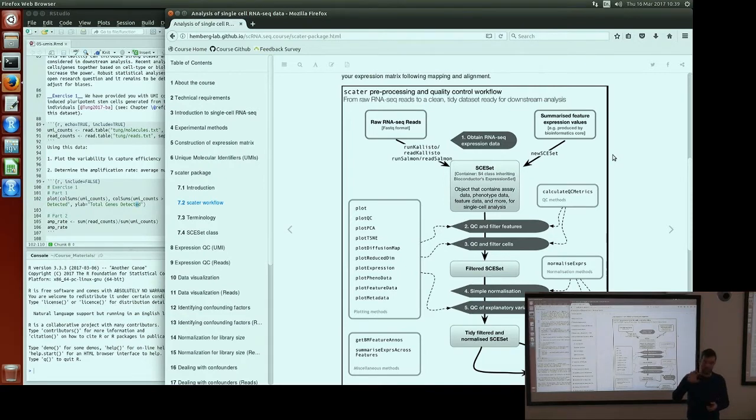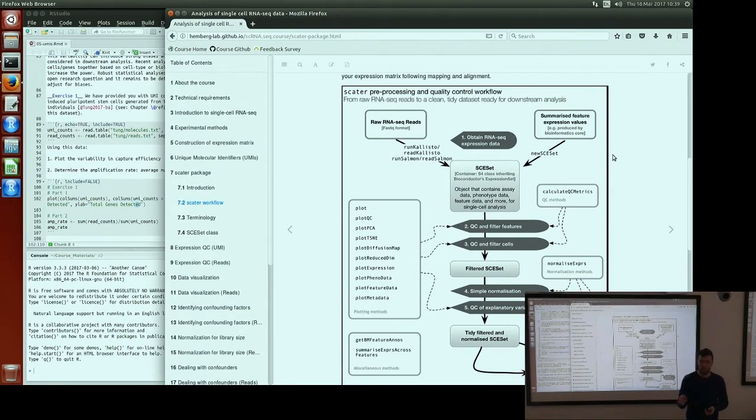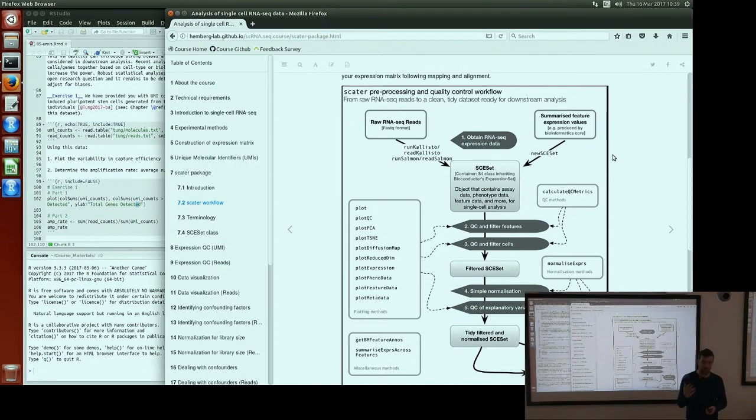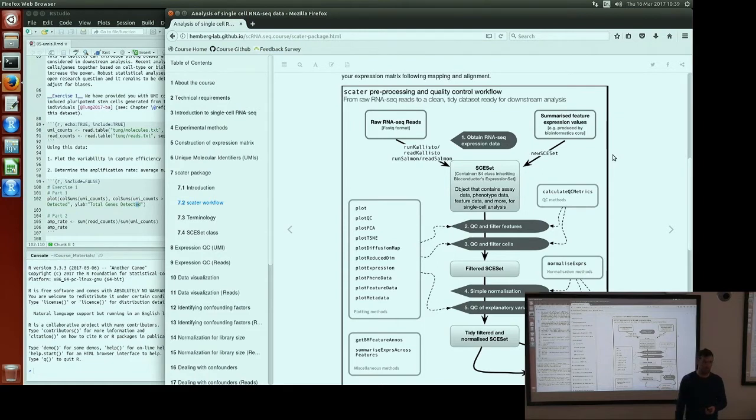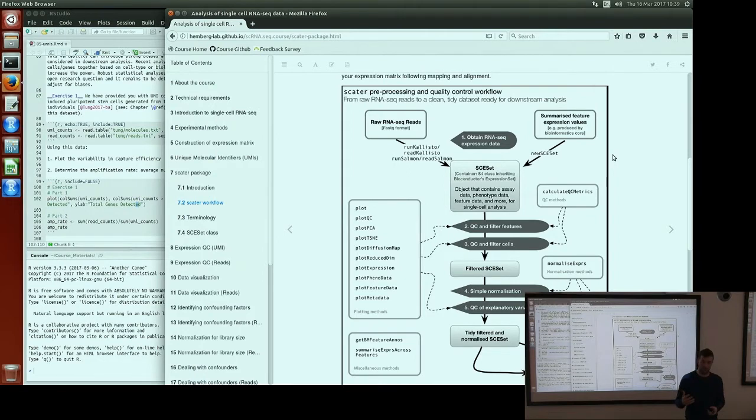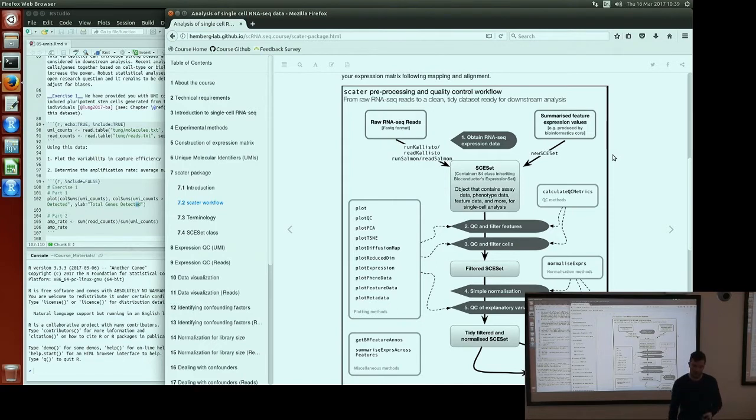Once we've got our data in this SCESet object, the first step is typically to apply this function called Calculate QC Metrics, which does what it says—in an automated way, it calculates a lot of QC metrics that we find useful for QC cells and genes. As you can see on the left-hand side, there are a lot of different plotting functions. PlotQC has a number of different QC types of plots useful for getting different views on the quality of our data. We can do cell level visualizations with PlotPCA, PlotTSNE, and PlotDiffusionMap for exploring how the cells look in reduced dimension space.